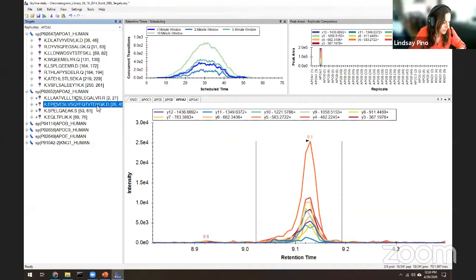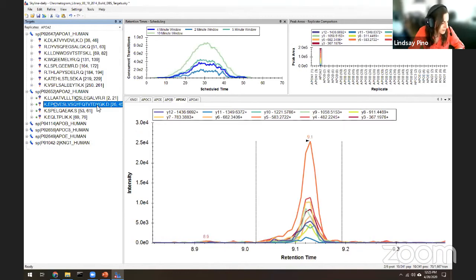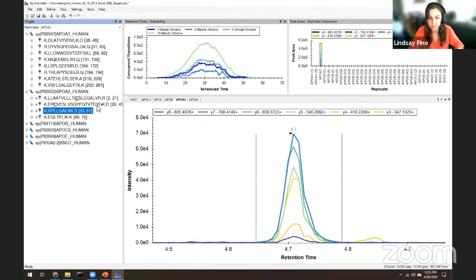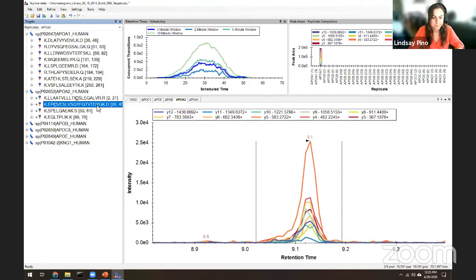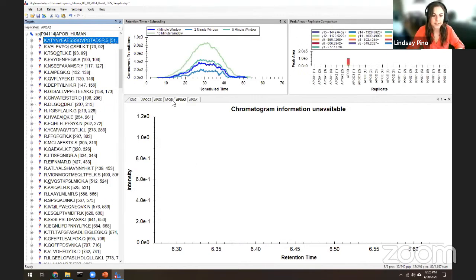Phosphopeptides fly both as +2 and +3. Do you choose both for quantification by summing up, or choose +2 for quant and +3 for selectivity? I would definitely say for phospho, just the same as an unmodified proteomics experiment, you would pick the most intense one. You could choose both and do the quantification by summing up the signal from both of them. But I would say it's probably not necessary to use both precursor charges for the same peptide sequence.